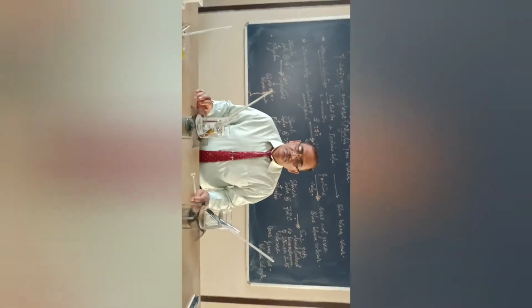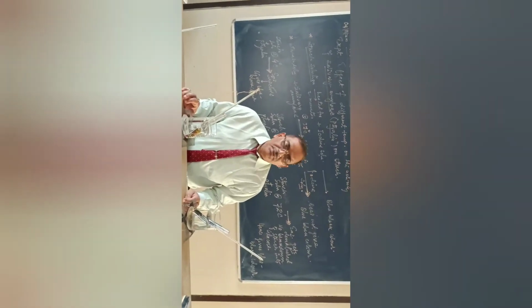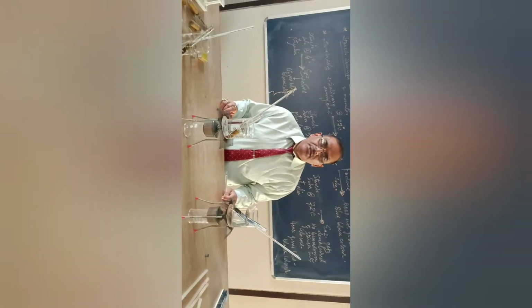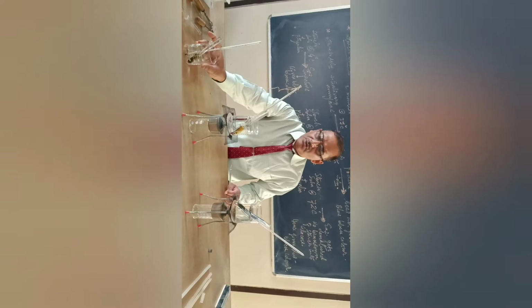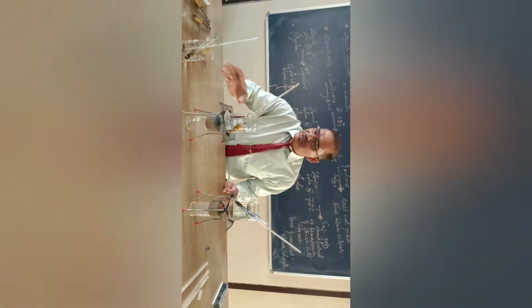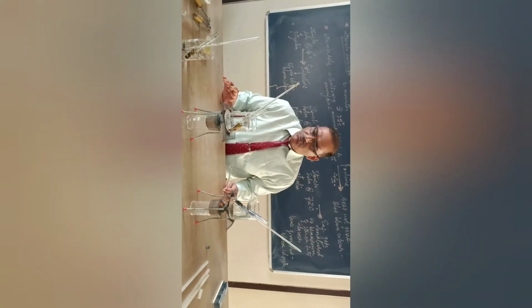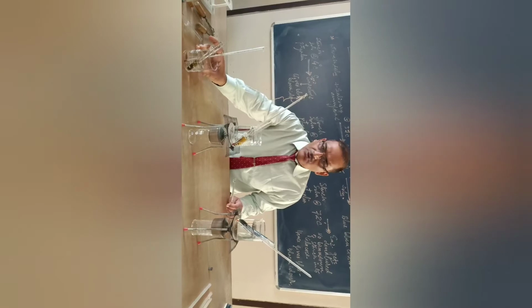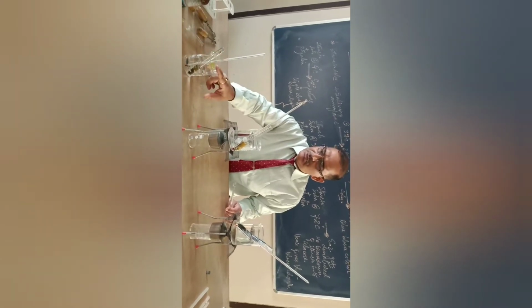Start. Now students, let me demonstrate the practical: effects of different temperature on the activity of salivary amylase. So now we have taken three types of water bath we have prepared. This is the water bath at very low temperature, around 4 degrees Celsius. So ice has been kept into this water, so the temperature is very low, around 4 degrees Celsius.